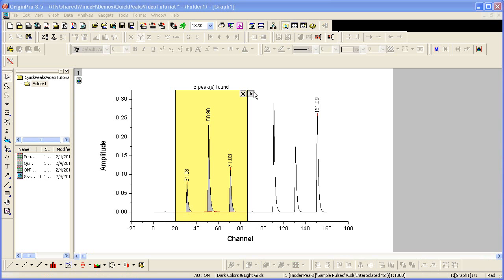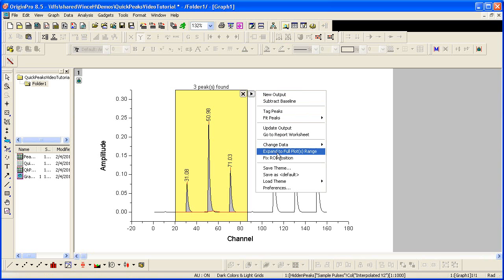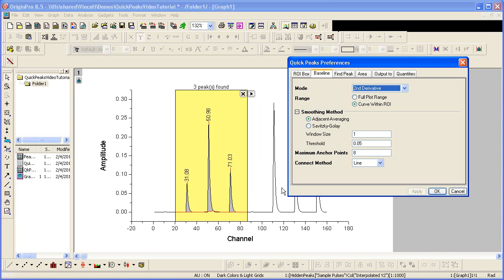I would now like to change some of my preferences. To do so, I select Preferences from the flyout. Again, the dialog opens.